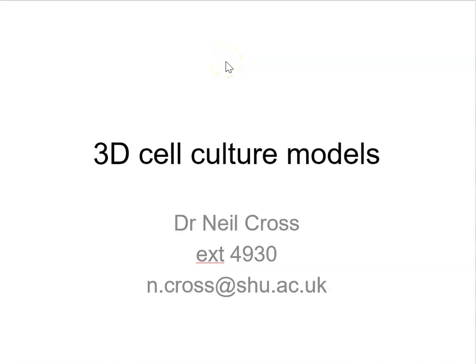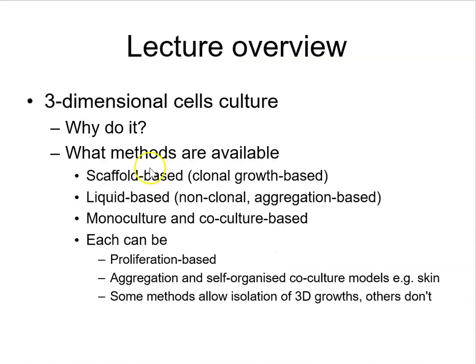Okay, in this session I'm going to be talking to you about 3D cell culture models, and I will take you through some recent research that we've done in our lab using various different 3D cell culture models to show you the scope of experiments that can be performed with those models. So this is what I'm going to cover in this session.